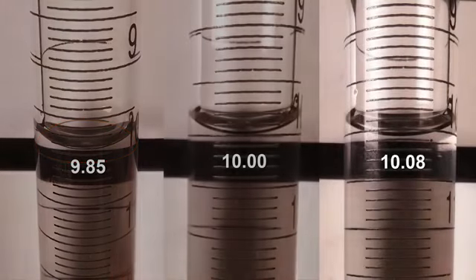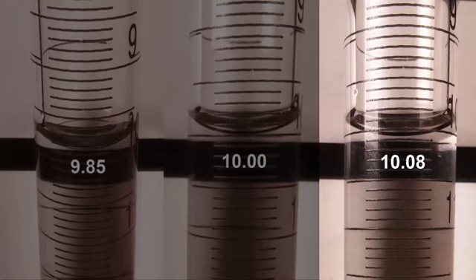The same problem occurs when the meniscus is above eye level, such as in this example. The apparent reading in this example is 10.08. Notice again how the encircling ring of the 10.00 milliliter mark can be seen around the burette.